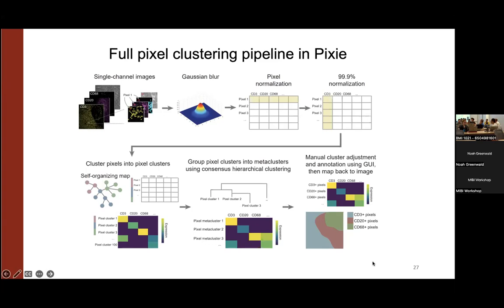And in the case of the stuff with Codex, if you look at that image, what you can see is that it's really just honing in on slide, which is where there's no other signal in any of the other channels. Because all the pixels are getting a categorical call and they can't be proportional, it's not a weighted sum of multiple orthogonal variables. So to your point, this can't really be used as a means of removing something like autofluorescence, which is an additive signal on top of the real signal.